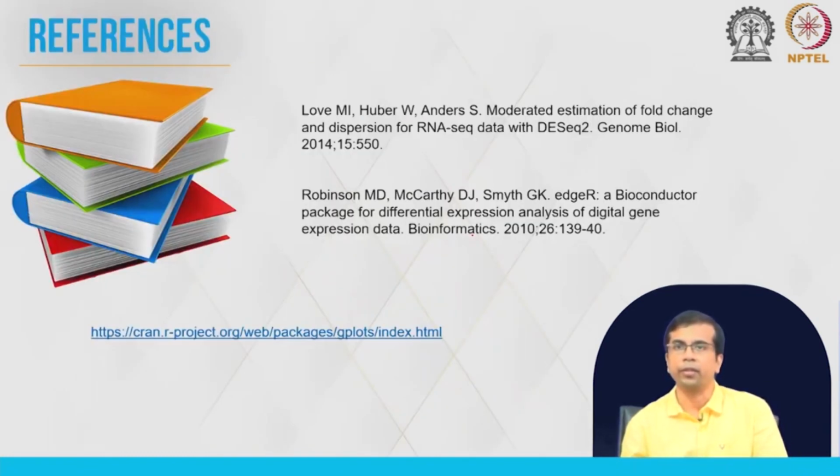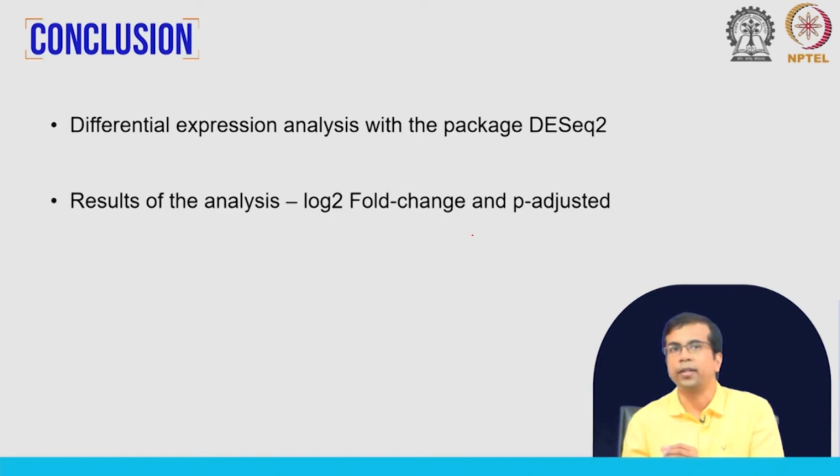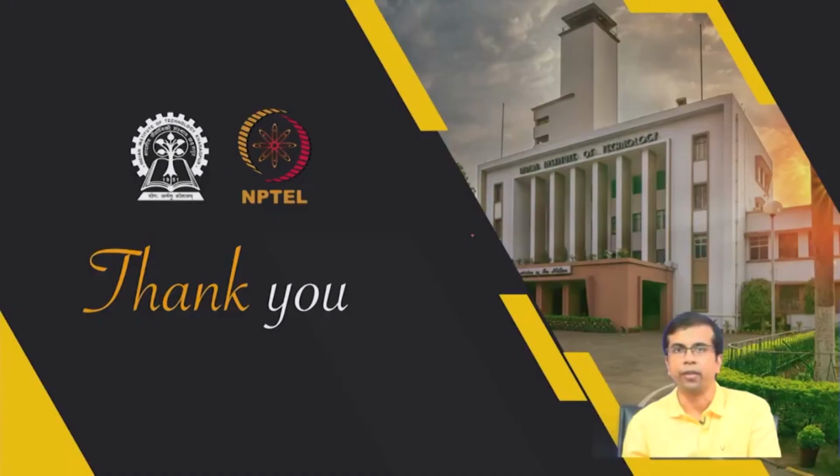So, we have talked about these different visualizations that help us understand the results better. Here are the references for this class. We have completed the differential expression analysis with the package DESeq2. At least I have discussed the theoretical steps. Of course, we will do it hands on, and we have seen the results that we get, and two results are very important for us. One is log 2 fold change, and the other is p adjusted. We have visualized the results through MA plot, volcano plot, and heat map. Again, we have seen there are some important insights that we get from this visualization.